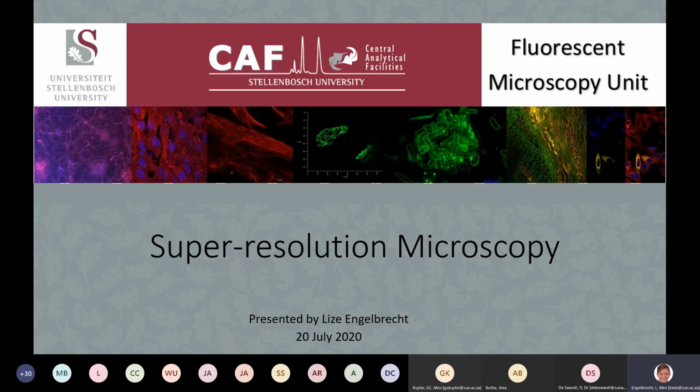Sorry, people. Right, from this slide, you can see that we need light microscopes and electron microscopes. And as I said, today we need electron microscopes to see viruses, DNA, molecules, proteins, and even down to atoms.